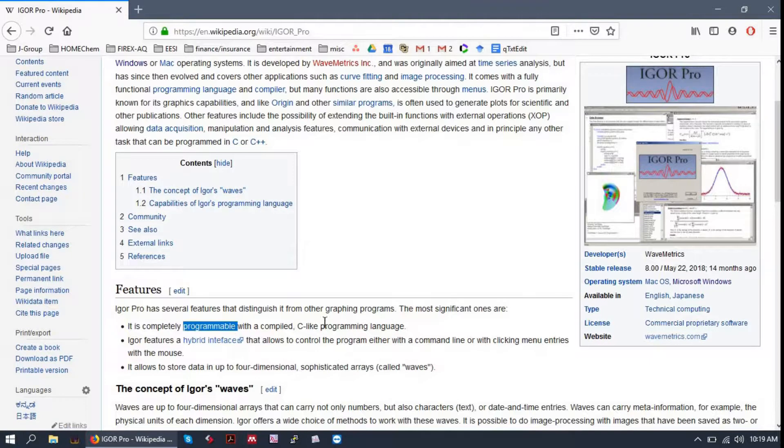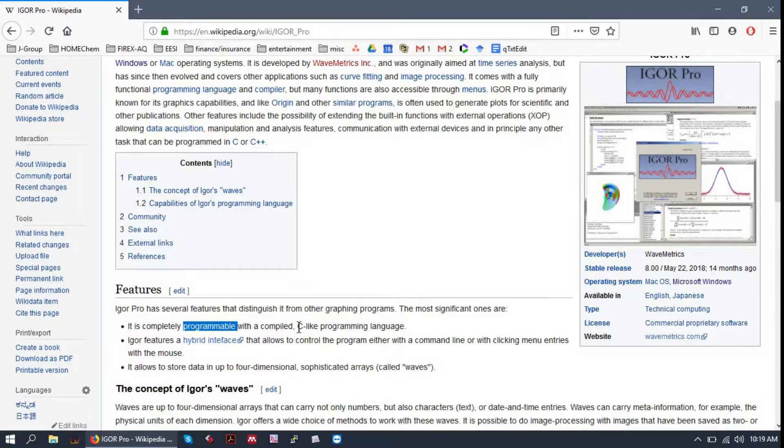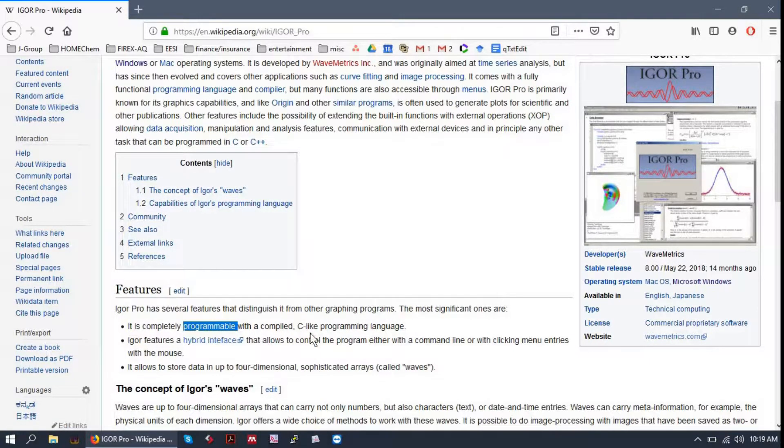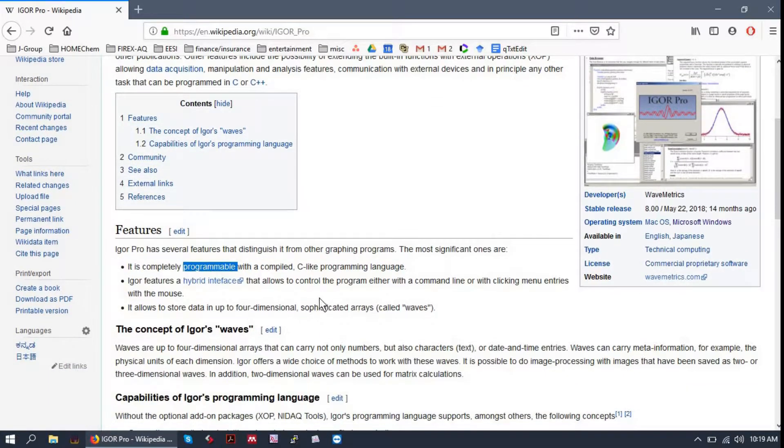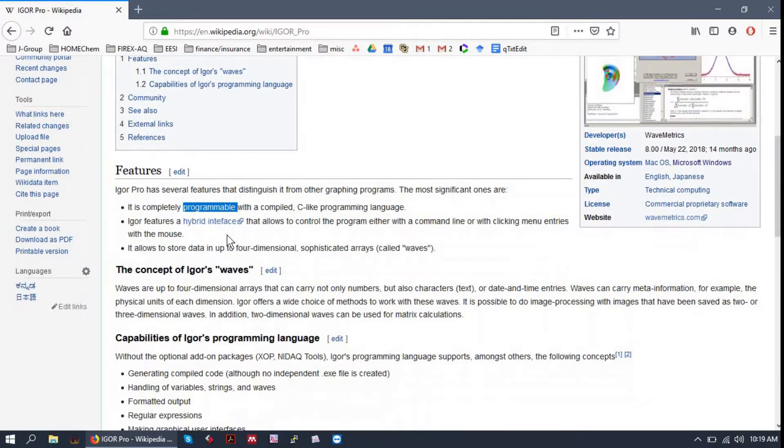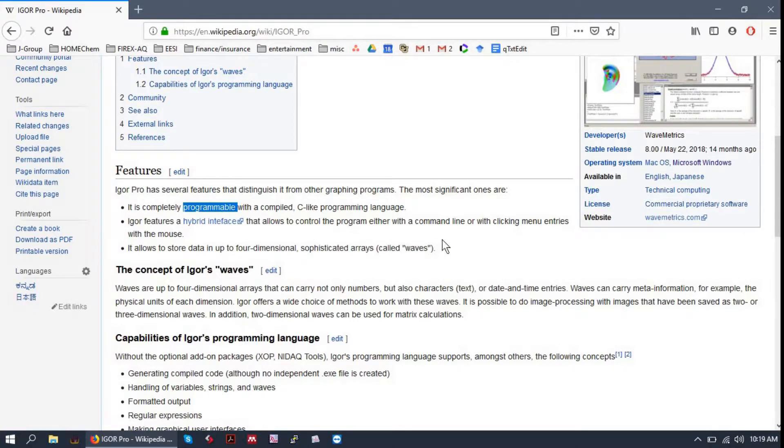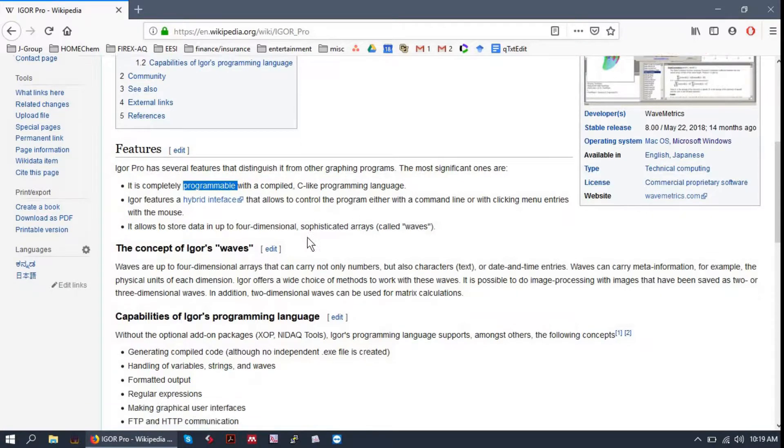It's completely programmable with its own language, similar to C, Python. If you're familiar with any of those, you'll have no problem getting into Igor. It has a hybrid interface, meaning that you can do most things from the command line or by clicking menus in the graphical user interface. So it's good for programmers and non-programmers alike.